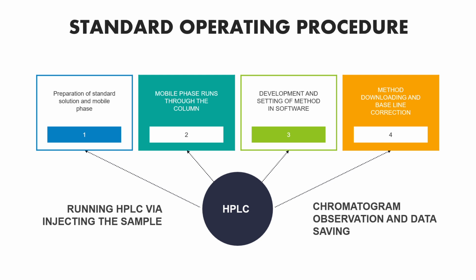After the completion of auto zero, inject the analyte solution through the injection port after turning the knob to the load position. Then we start the HPLC run on the software and turn the knob to the inject position.